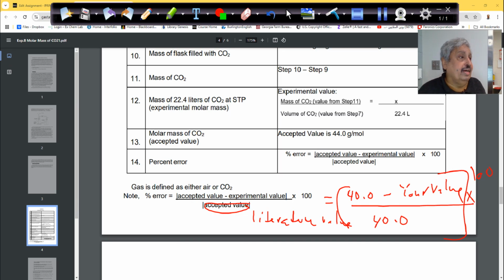And then when you are done, we'll dump out the HCl with the whole thing in, not in the sink. We have here a container for the waste, okay? If you have leftover solid calcium carbonate, we will not throw it in the sink. Add more HCl to it to get rid of it, correct?